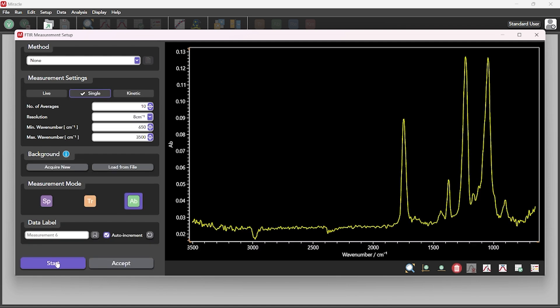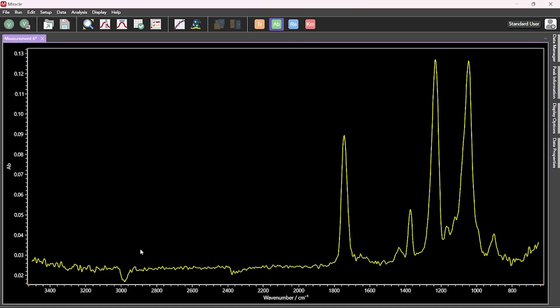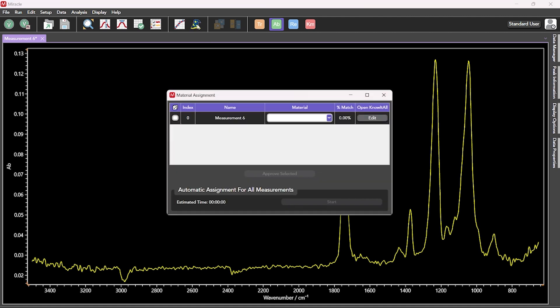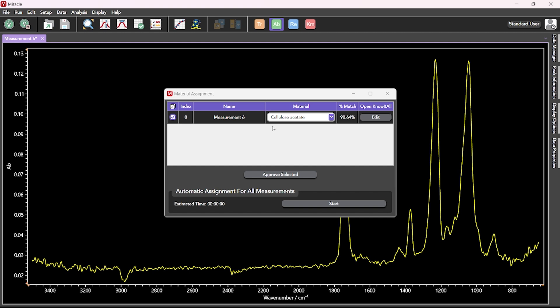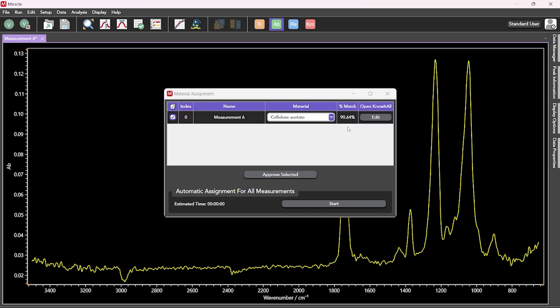Once a suitable spectrum has been obtained and accepted, it can be analysed by selecting the KnowItAll button in the toolbar at the top of the screen. An analysis window will now appear and begin analysing the spectrum. After a short time, a material assignment along with a percentage match will be shown.